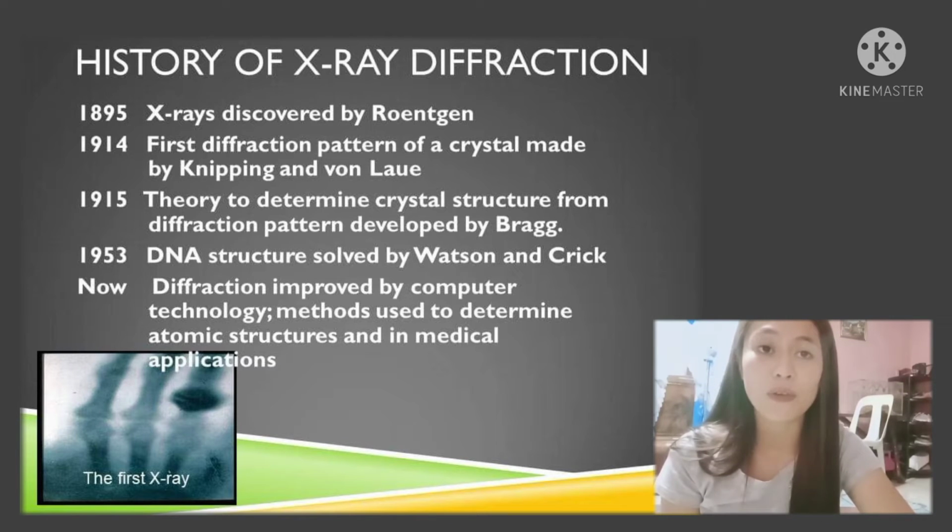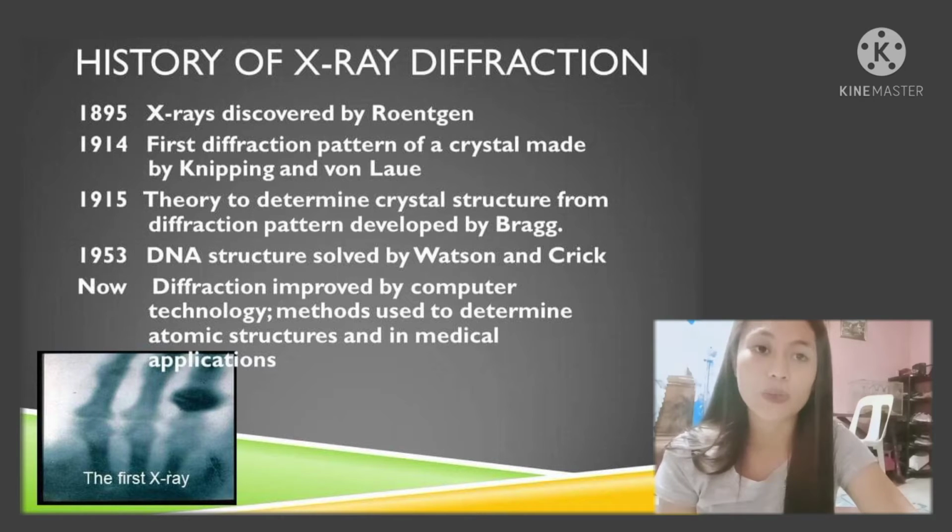The first scatter process to be recognized was discovered by Max von Laue, who was awarded the Nobel Prize in Physics in 1914. He showed that if a beam of X-rays passed through a crystal, diffraction would take place at right angles to the direction of the rays. The discovery provided a new method for investigating the fine structure of matter.